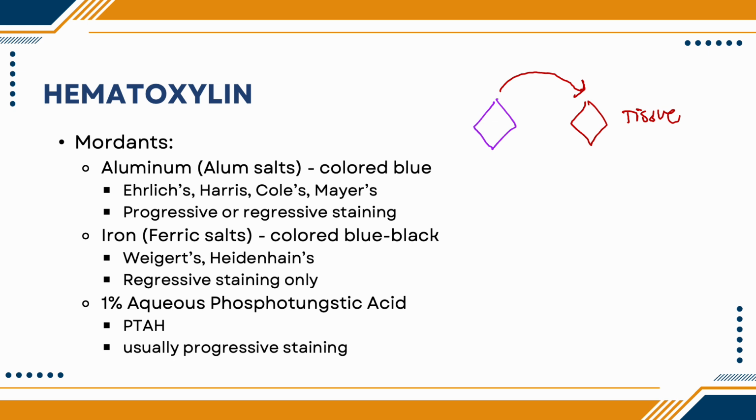The mordant acts as a bridge. So, this is what a mordant does. The stain will now bind to the mordant, and the mordant will now bind to the tissue. Meaning to say, the mordant is required in order for the staining to proceed.